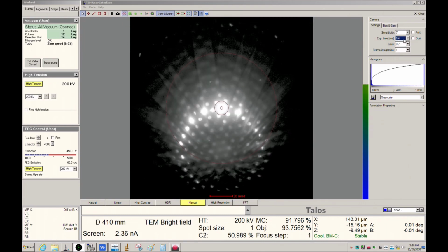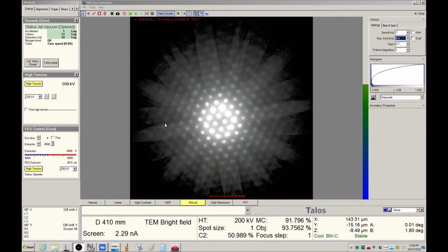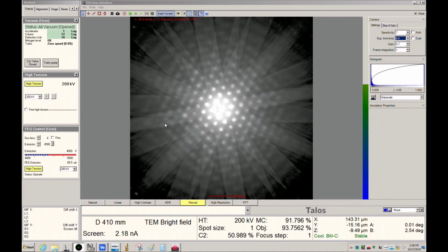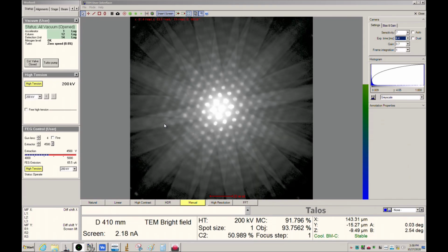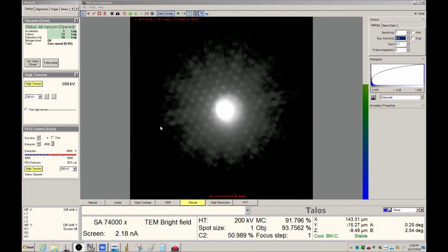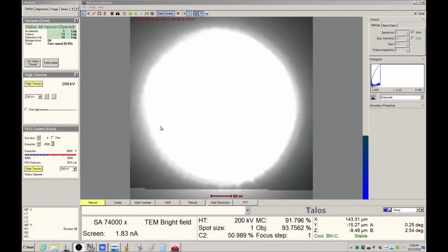Okay, so step one of deriving the tilt map is that you've got to get to the zone axis to begin with. Now don't worry about how you got there initially, just get to the zone axis. Don't worry about what you did to do it. But you have to start from what you're seeing here, where you have basically perfect zone axis alignment.